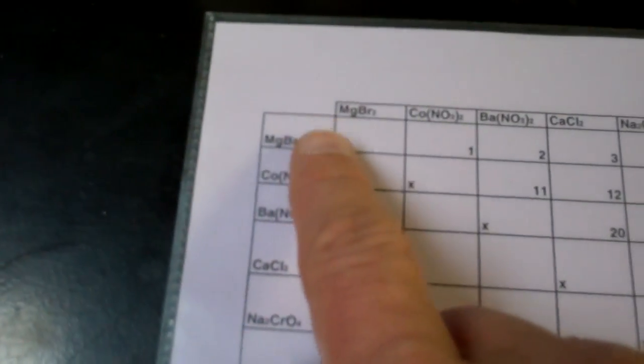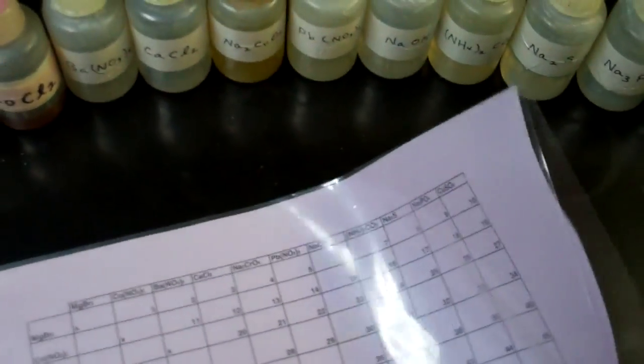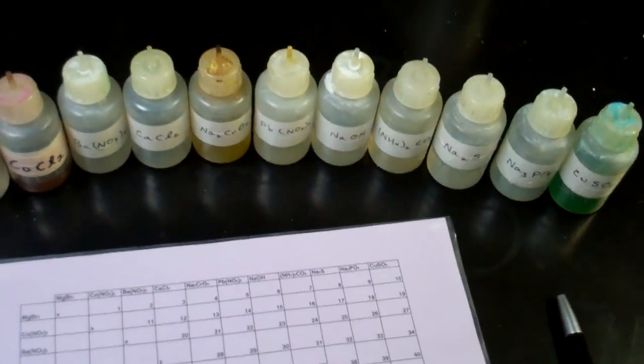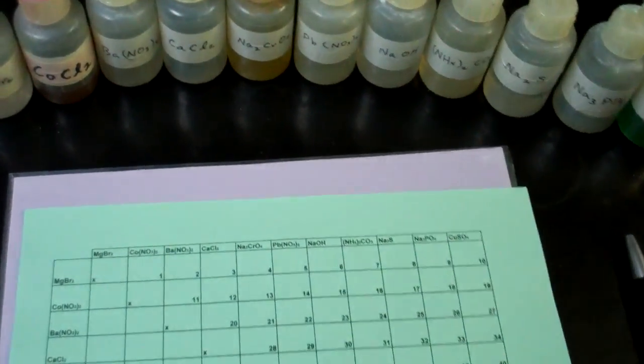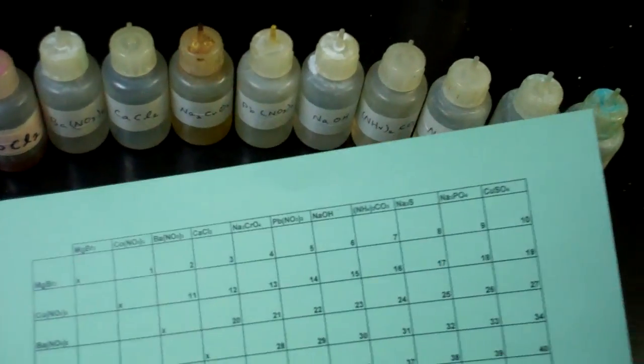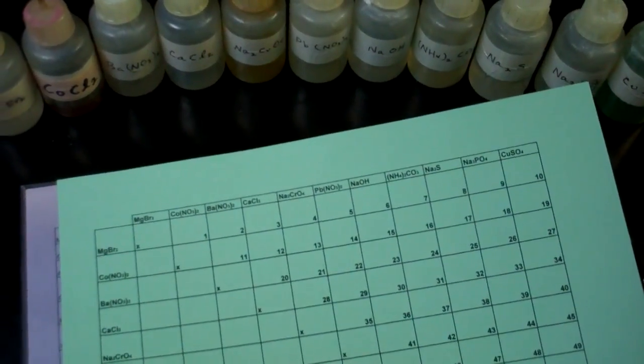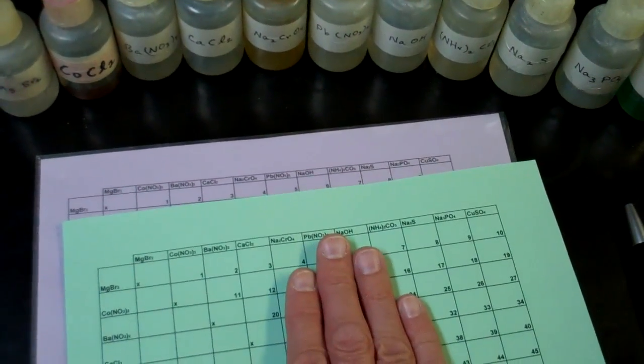These are the same solutions that we have on our data table going across and also down the side. Now, the copy of your data table is placed inside a sheet protector. You'll see why in just a moment, and yours is purple. You'll also receive, for your use, a green data table. That's really not green for any reason other than I thought it would be different and fun to use green paper today.